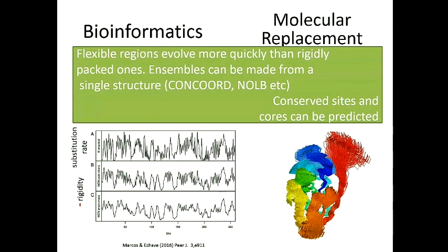The second section has a couple of ideas, but one of them is based on non-trivial editing of single distant homologues, so structures that you can recognize as homologous to your target but which are not close enough to work easily with the usual kind of editing and tweaks.